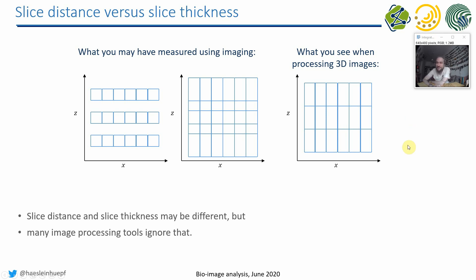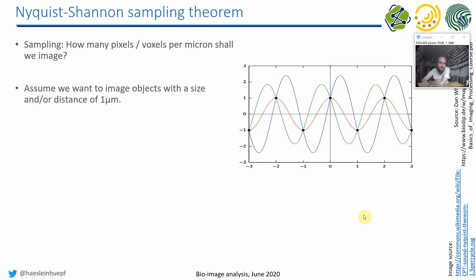This becomes especially important when you think about objects which are smaller than the slice distance. For example, a nucleus sitting between slices was not imaged at all and therefore doesn't appear in the image. Alternatively, a nucleus sitting between two slices may be imaged twice, appearing larger than it actually is. This is just to raise awareness for the difference between slice distance and slice thickness.